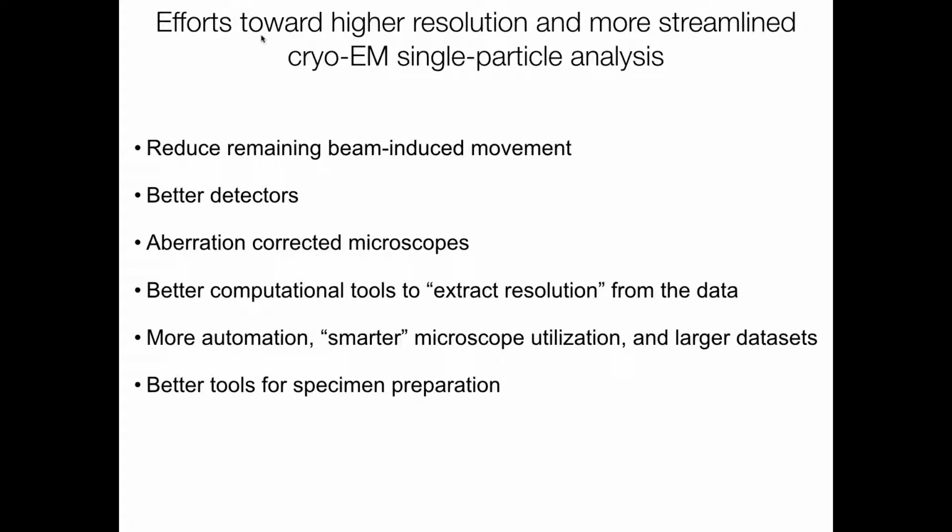When you mentioned Gabe's paper, why are they able to use 200 kV to look at smaller particles? I was just wondering, is the issue with resolution more significant than that? I don't know, we don't know. I would expect it to be more significant at 200 kV, but I don't think they've done these comparisons.